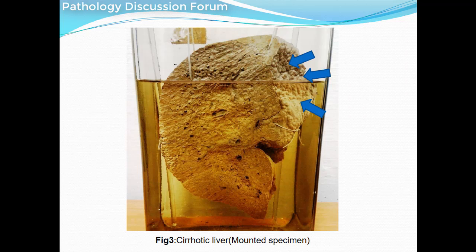So, at the end of this session, shall we be able to identify the specimen of cirrhosis of liver? I think you are saying yes.